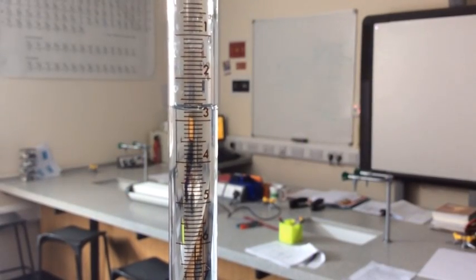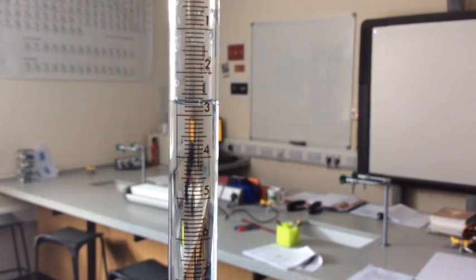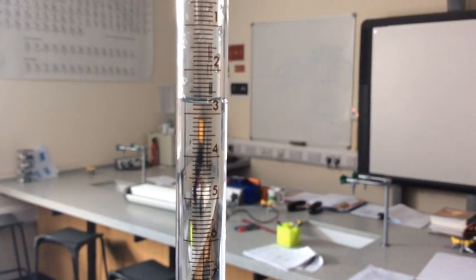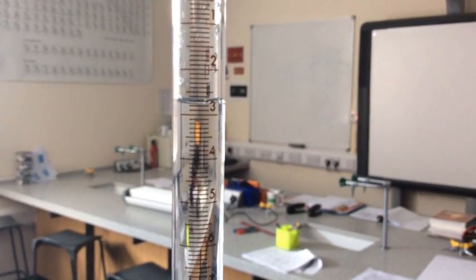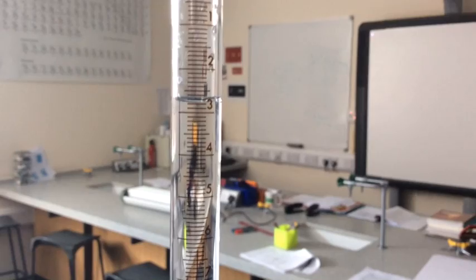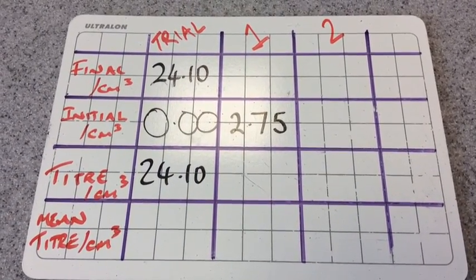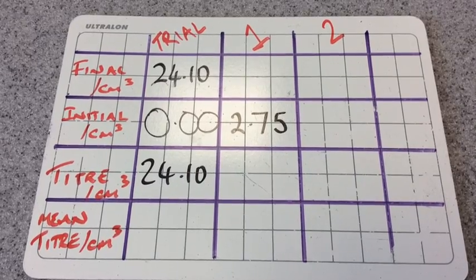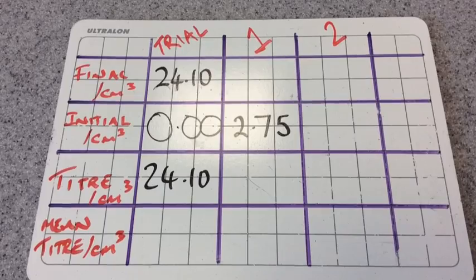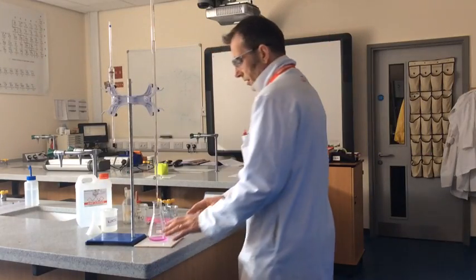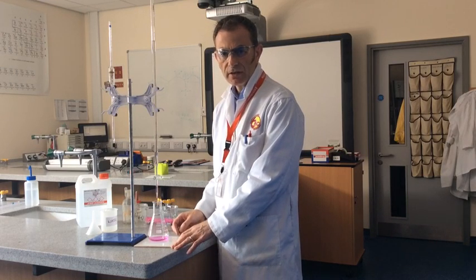So I've filled the burette up for the second titration. So this is going to be our first accurate one. And you can see there the meniscus is just below the 2.7 line. So that will be recorded as 2.75. And the reason I've done that is because I want to make the point you don't have to start at 0.00. As long as you know where you start, you can always work out the difference. So I'm ready to start the second titration now. Remember that's the first accurate titration.